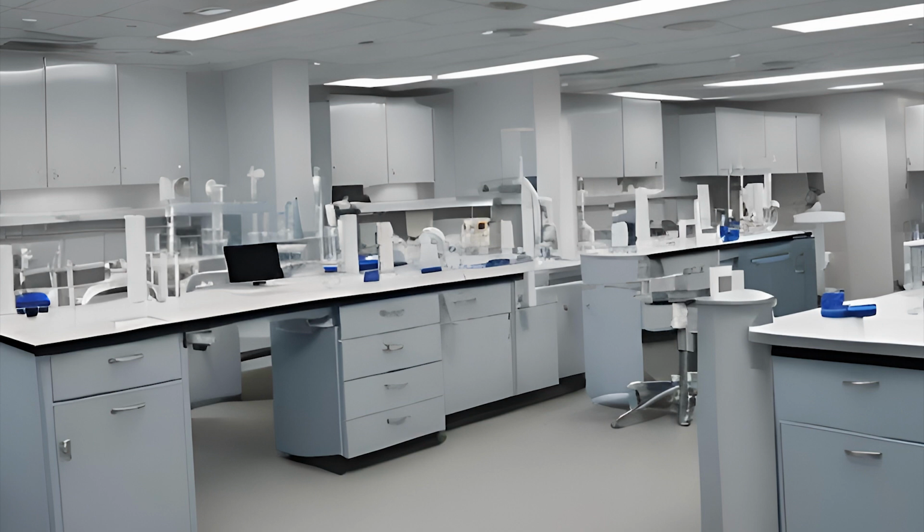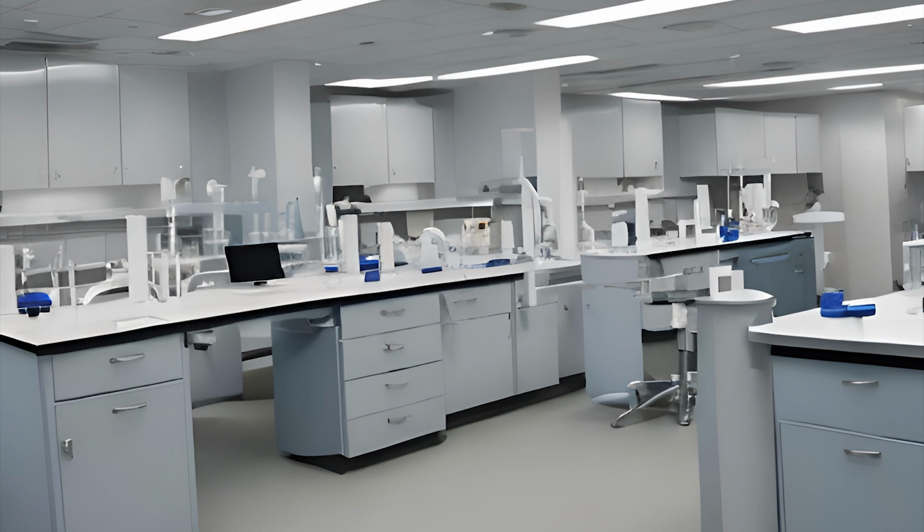What you want to do is crush ice, pour water over that crushed ice, and then put the tube in a little biohazard bag so that the label on the tube doesn't get soaked and fall off, and submerge that whole setup underneath the level of the water that's in the ice. Large cubes or chunks of ice without water are not going to adequately cool that specimen.